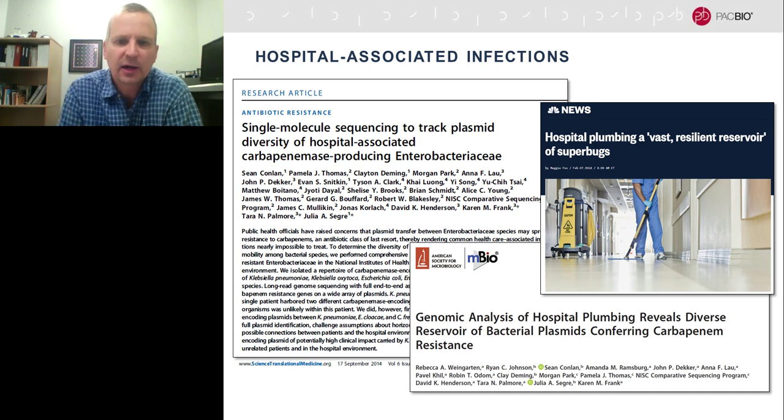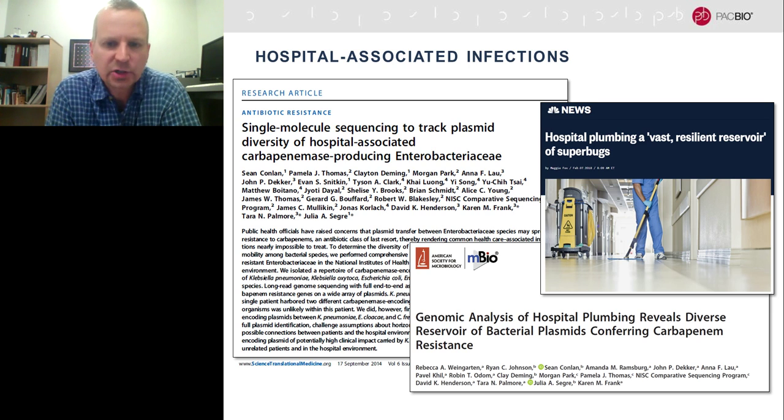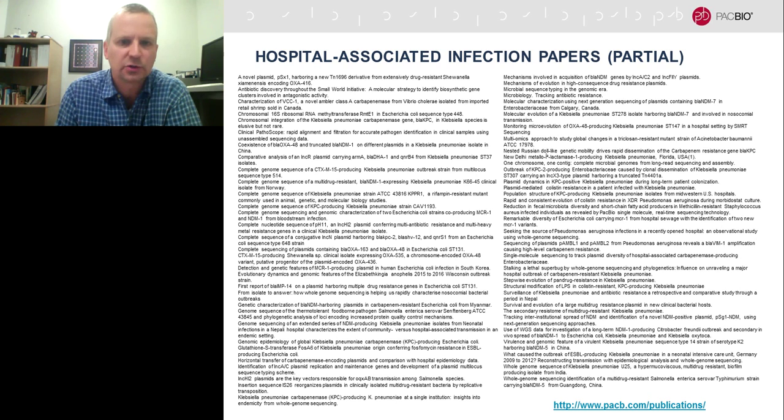And more recently, there was a follow-up paper looking at more of these types of bacterial strains in the hospital setting and finding, and this was again highlighted in the mainstream news, that there is an occurrence of these very dangerous bacteria, not only in patients, but also in the plumbing. In the sink drains are the bacteria that harbor some of these very dangerous multi-drug resistant plasmids, and then through horizontal gene transfer, that can then cause an outbreak. So this has already had some ramifications. The complete understanding using PacBio sequencing has had ramifications in hospitals rethinking and changing their hygiene procedures.